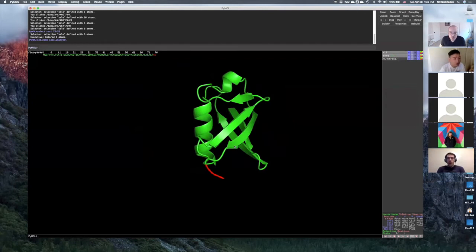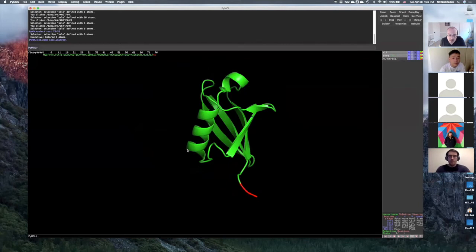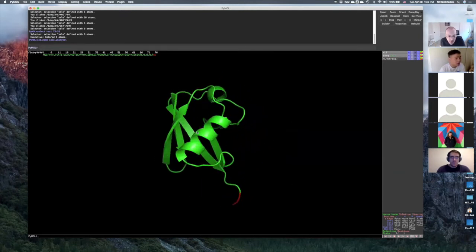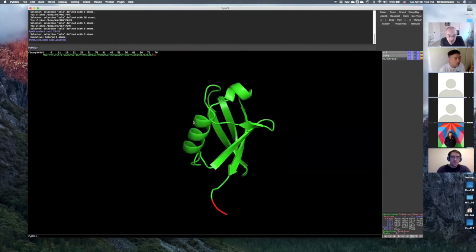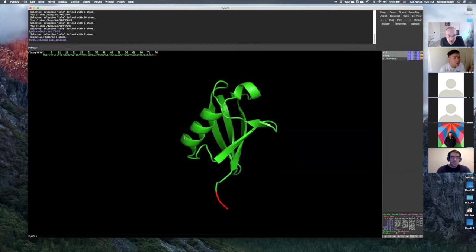So now what I want to do, I want to explore how many lysines we have in ubiquitin, what are the lysines, and how can we select all the lysines in one simple command, okay? So to do that, first of all, I want to change the background to a paper style background. So we usually publish papers in a white background. So I want to change the background.